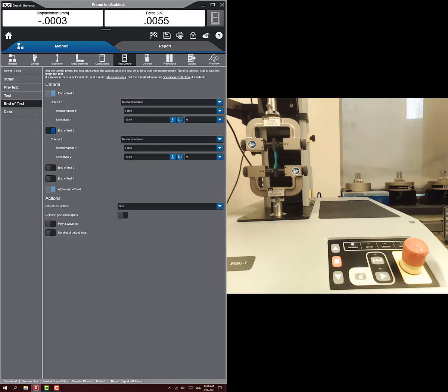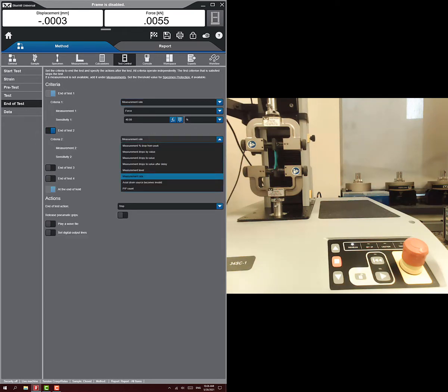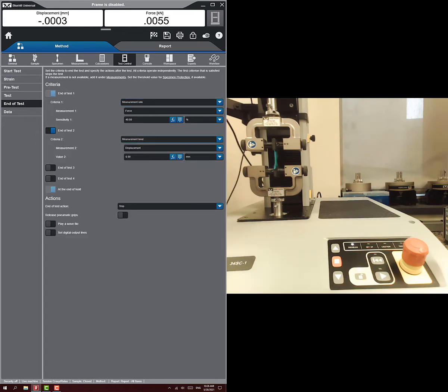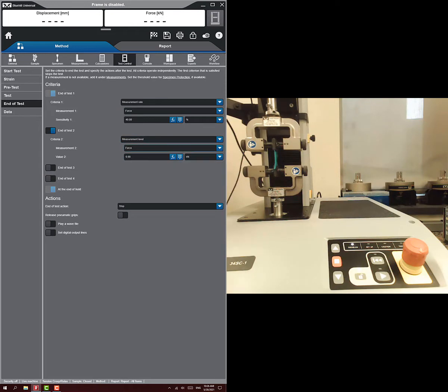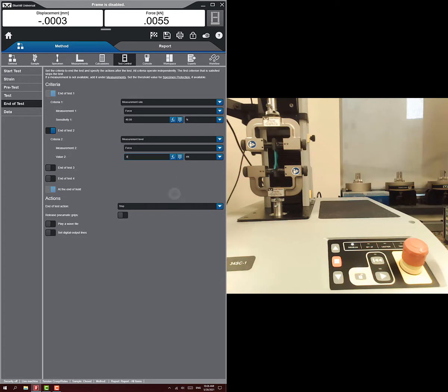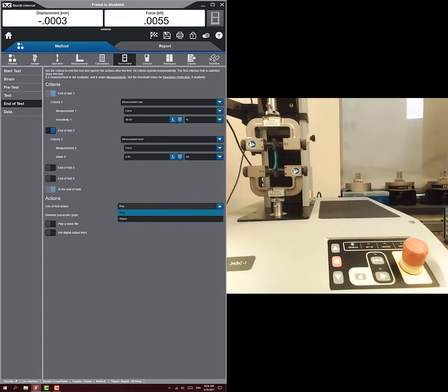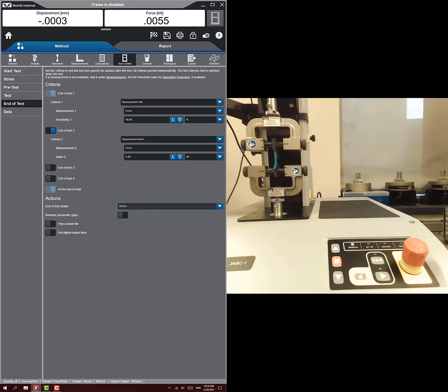The other thing that I always want you guys to do is to make sure you set a measurement level of force of 0.8 to protect the load cell, just in case we get high forces. We don't want to overwhelm the load cell. For this one end of test action, I'm going to just go immediately return. That way I don't have to hit the buttons on the Instron machine to return.